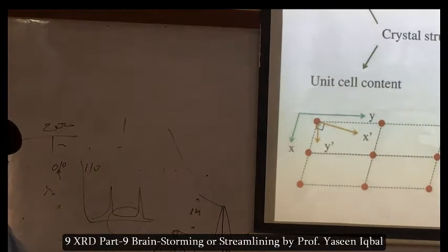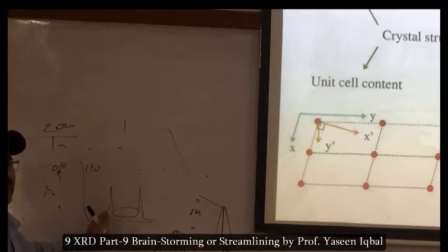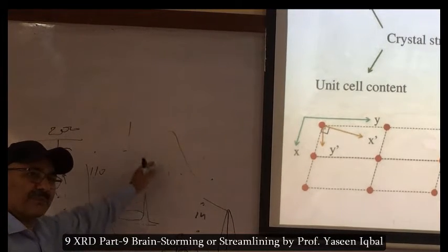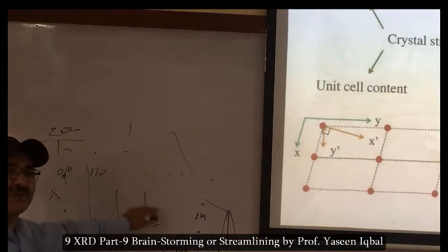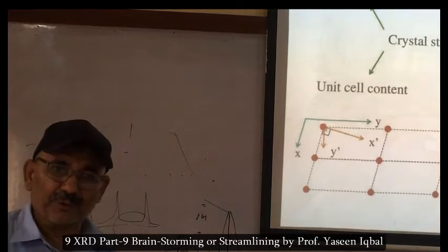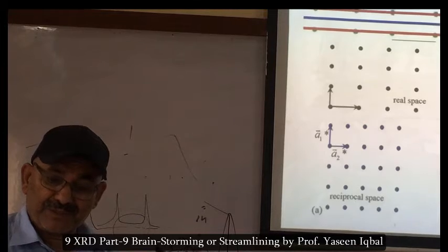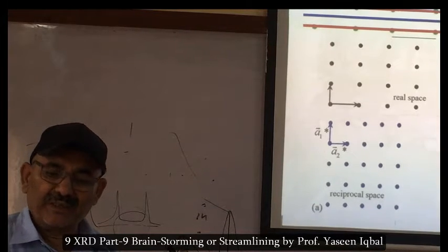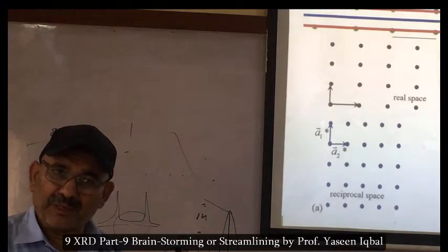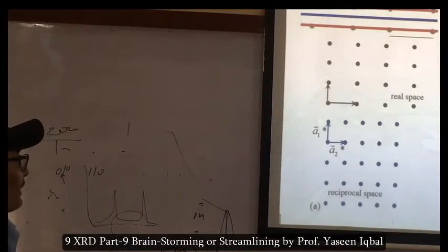scanning the whole sample. It gives us a peak here, then comes down here, then gives us a peak here. So what happens in between? This is important to know. Atoms are behaving as scattering centers, right? Keep that in mind. I am coming to that point later.